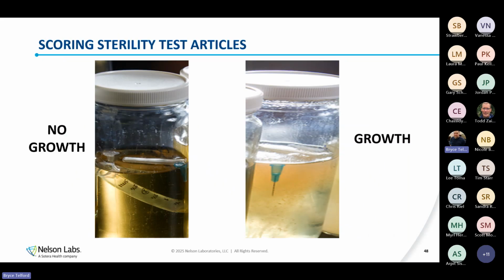So one of those is sterility scoring, where we talk about growth and no growth. Like I've mentioned, there's really nothing to it. It's just a matter of holding the bottle up and seeing: did it grow, did it not grow? But some products have a sterility claim that is specific. Let's say I have a tubing set. I might claim only the fluid pathway of the tubing set as being sterile.